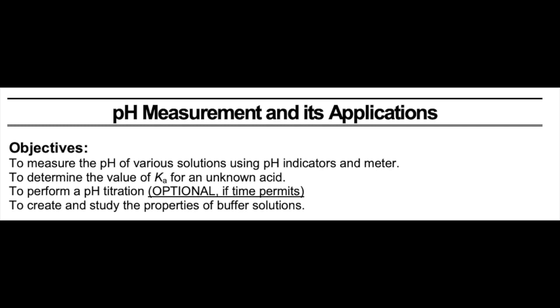Hi everyone. This video will show you the actual experimental steps and data collected for the pH and buffer lab. Your instructor may ask you questions related to the procedure or data shown in the video. As you're going through the videos, it's useful to have the lab procedure and lab report with you so you can write down all the relevant observations.